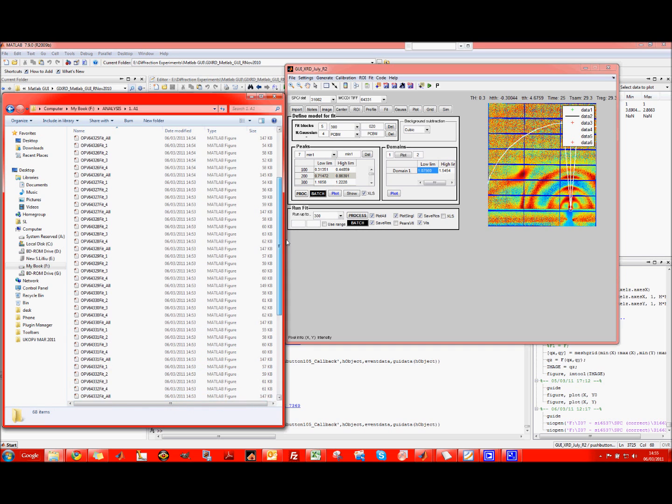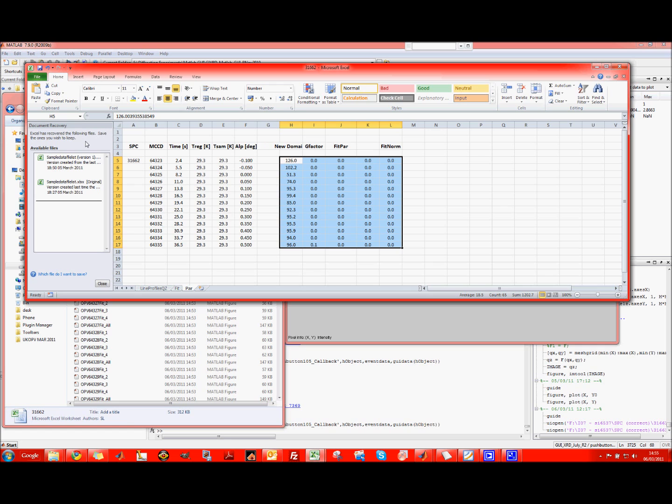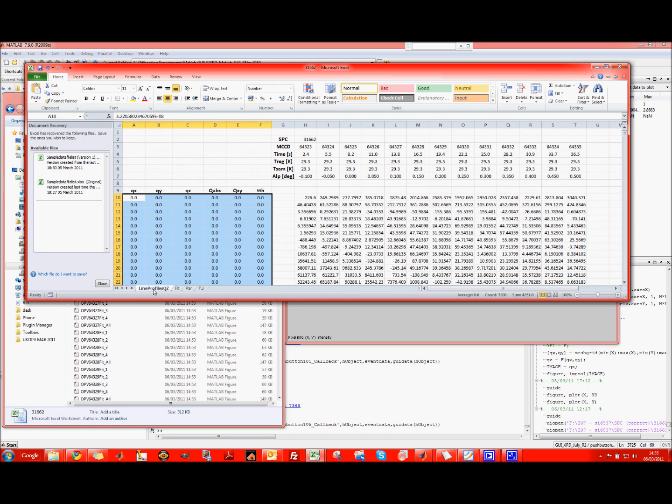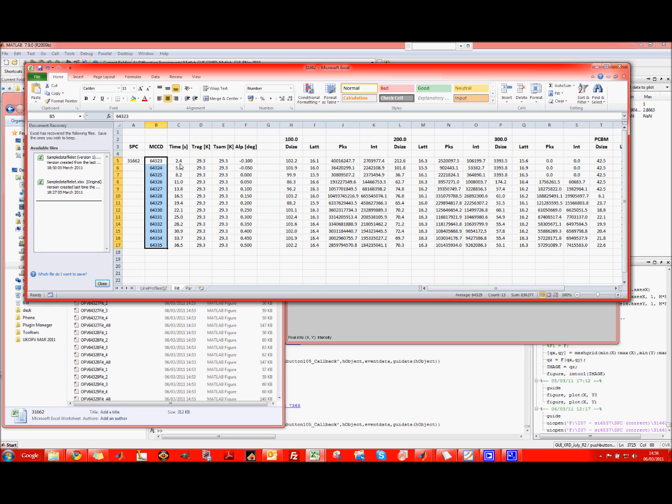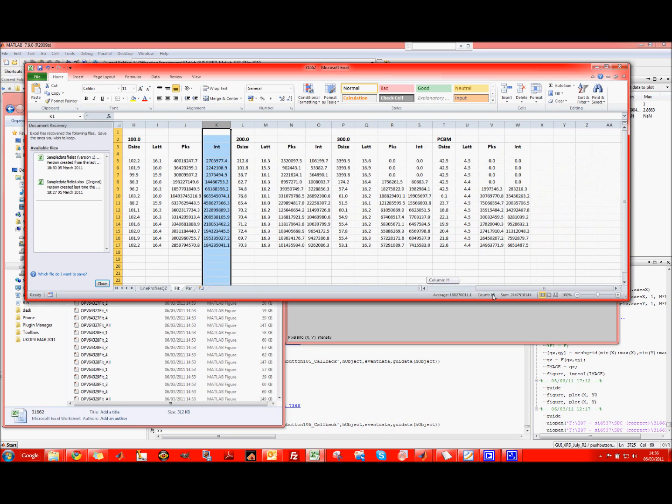Yes. Now we can open the Excel file. The Excel file contains the line profiles, fit, so diff file, time, sample temperature, angle, domain size calculated with the Scherrer equation, lattice constant calculated using 2 pi divided by the Q value in the position of the peak intensity, the peak integral, and so on.